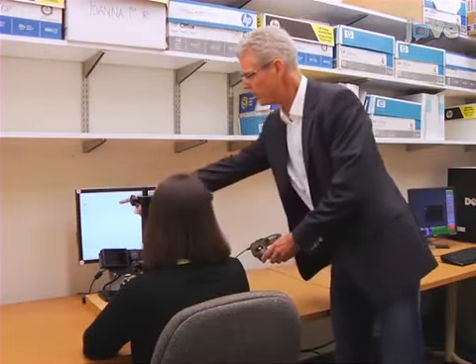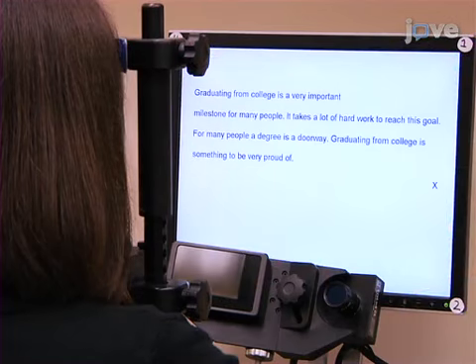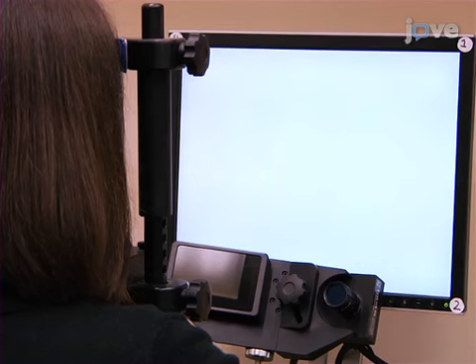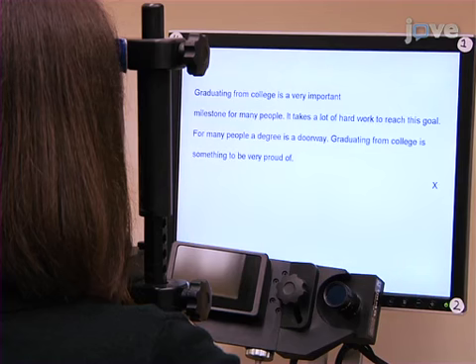After instructing the subject to refrain from talking or making other head movements, begin the experiment with a small number of practice trials. Before each trial, instruct the subject to fixate on the drift correction point, which is displayed where the first word of the text will be presented. Instruct the subject to read at a normal rate for comprehension and to press a button on a response pad when they finish reading each passage.